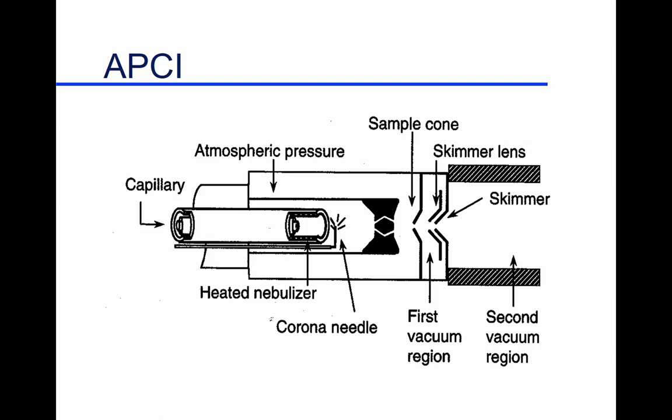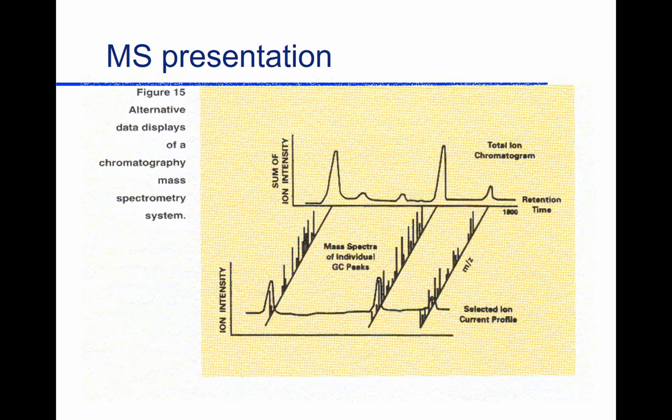And so this type of mass spectrometer is really good for sampling gases. You may put it into a balloon and go up into the atmosphere, look at pollution, look at the upper atmospheric environment. I put it up people's noses, and so I can analyze what they just ate and what aroma chemicals your olfactory region actually gets. I don't actually put that up to your nose, but I take the capillary that comes here and put it up your nose. Then I give you some food to eat, some orange juice, and of course you exhale. That's how you smell the orange juice. And I sample what you just got for a stimulus that makes you say, oh, that's good, or that's bad. It's really a powerful technique to use.